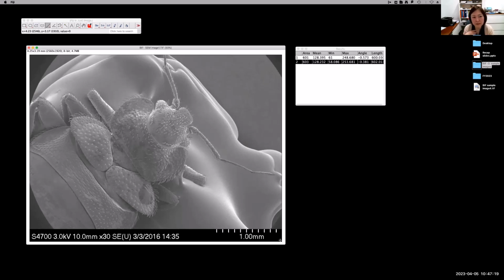Sometimes when you open those raw files, you can see all the scale information already. Additional information is available in a PowerPoint file, slides you can download from the OSF storage server.